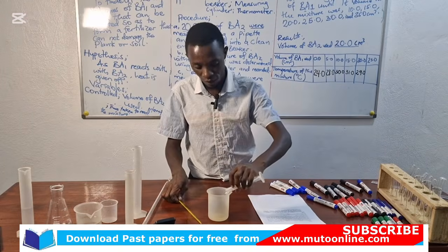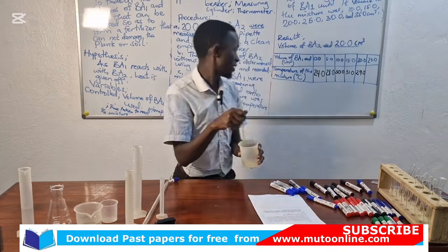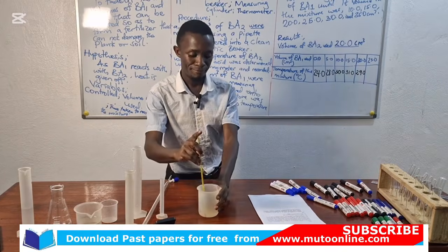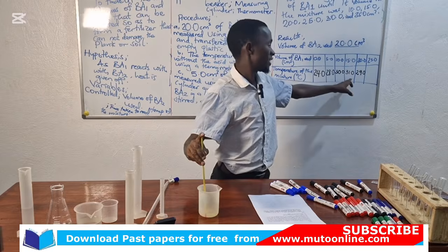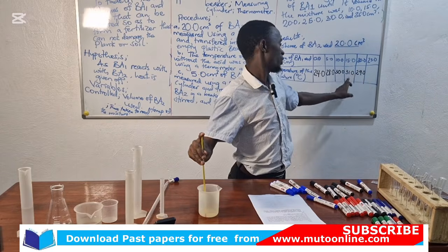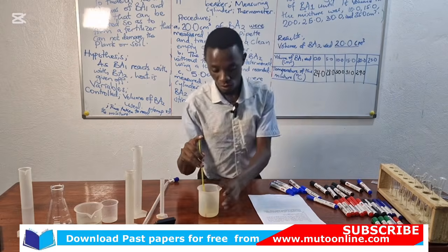So I'm adding more 5. I think we see the trend. I'm stirring. Remember, the temperature was increasing until a certain value, then it started dropping. So it was 31 and it is now dropping to 29.